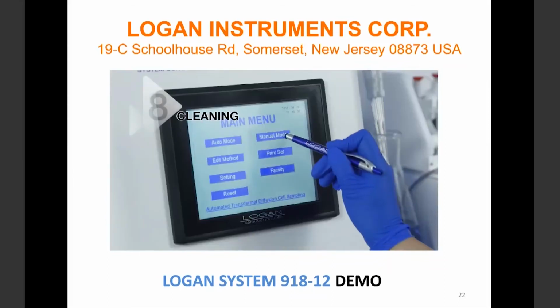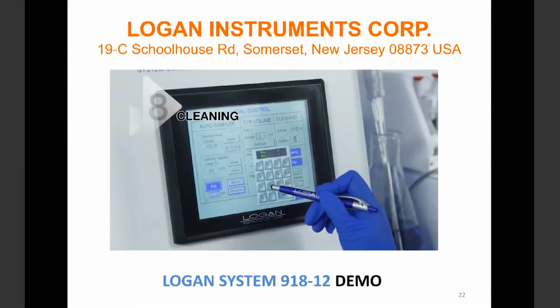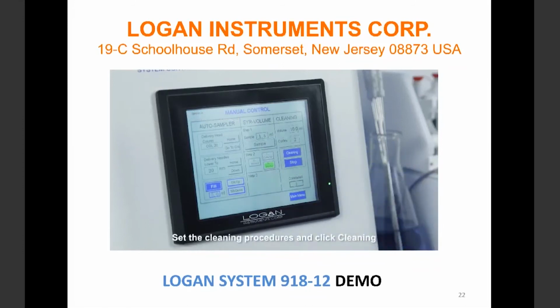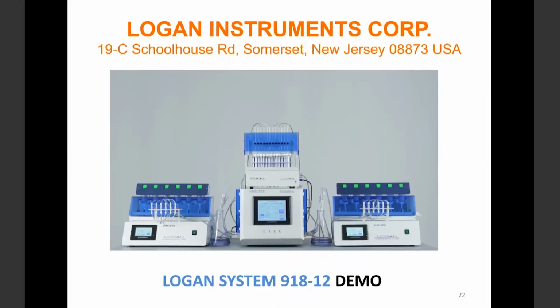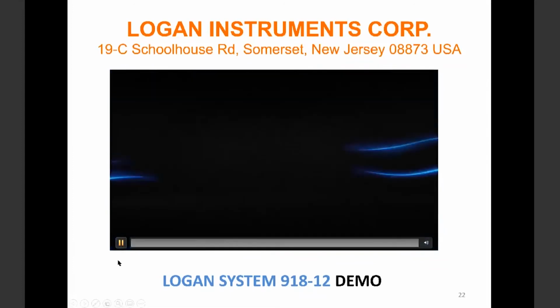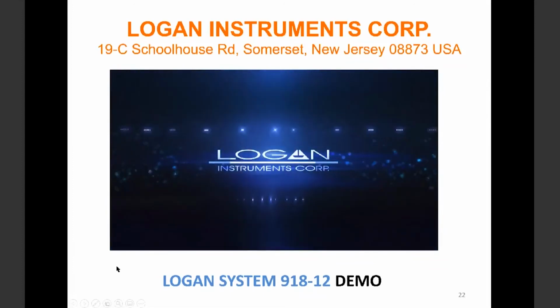Step 8. Cleaning. Set the cleaning procedures and click Cleaning. The cleaning method can be set before the test, so after the test is over, the system will automatically start the cleaning.